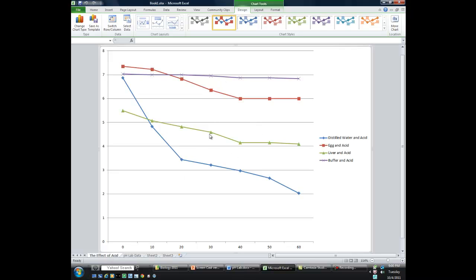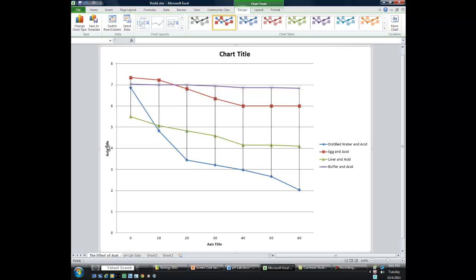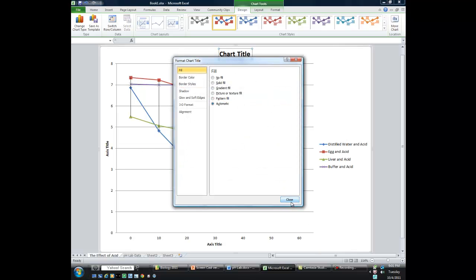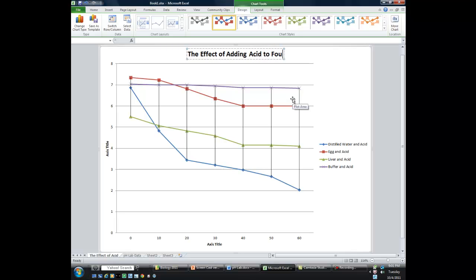Now the chart is not complete — we need a title and we need to label our axes. So go over to where it says Chart Layouts and select from the Chart Layouts. The best one for this particular chart is Layout 10. That allows you to have a title and the axes labeled. You just click on where the chart title is, highlight that, and put in your own title. So this one was: the Effect of Adding Acid to Four Solutions.